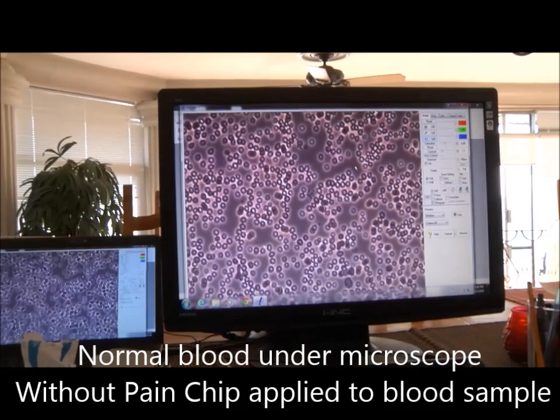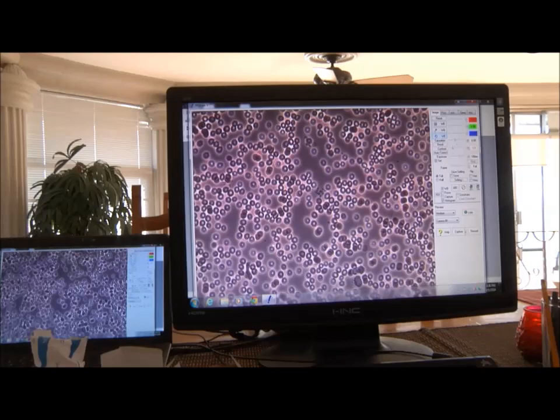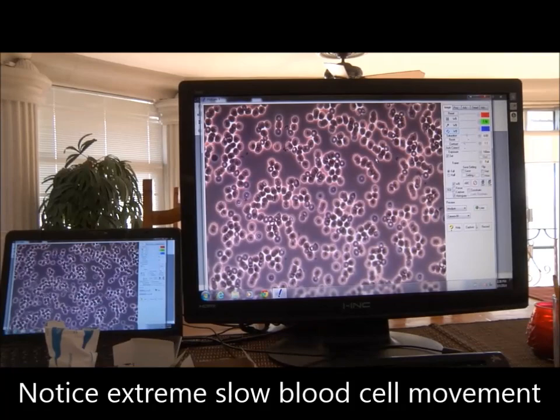Explain what we're looking at now. Well, first of all, this is normal — this is how it should look. That section possibly... well, let's just say this is the normal blood. Now let's have some fun and do a pain chip right here. Oh cool.